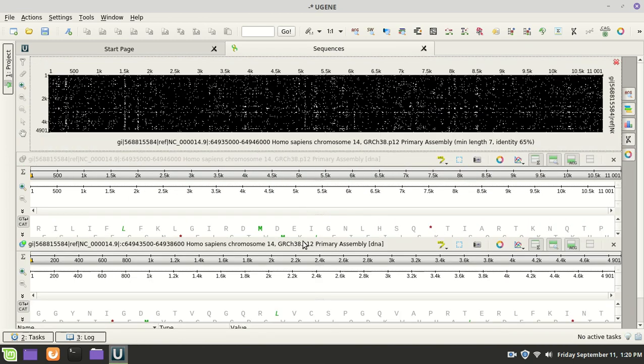Okay, but I still can't get this. I want to get rid of this. Stretch it, and this normally works. Huh, really strange. I don't know why it's not working, but I wanted this to be stretched out to be a longer plot. We'll work with it as it is here. I don't know why this isn't working. And when I tried to kill this before, it killed everything.